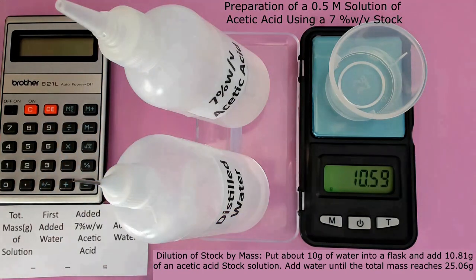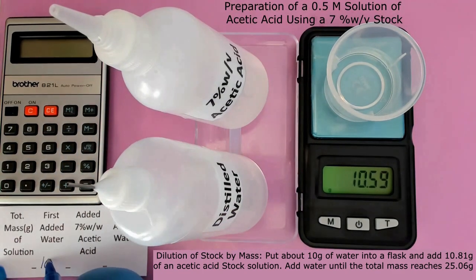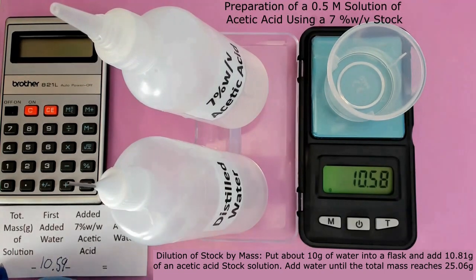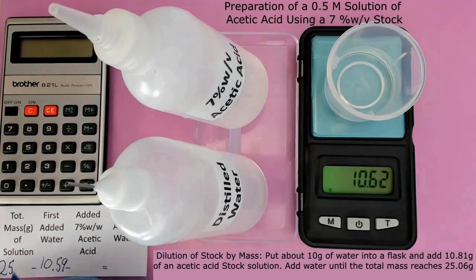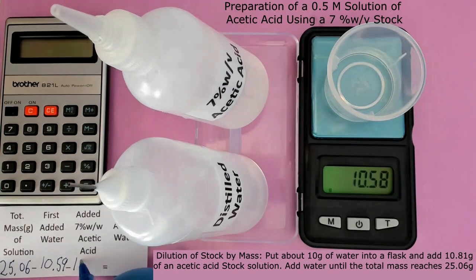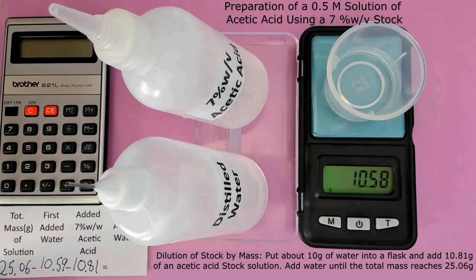Write it down. To calculate the final amount of water needed, subtract the combined mass of the added water and the acetic acid from the total target mass of the solution.